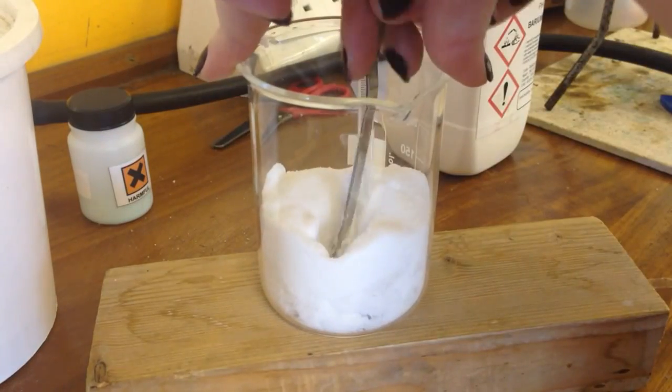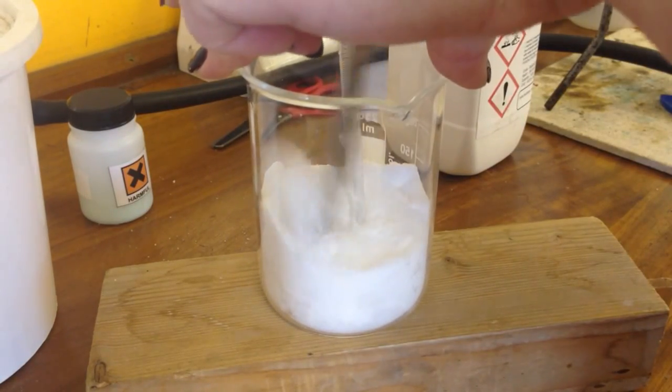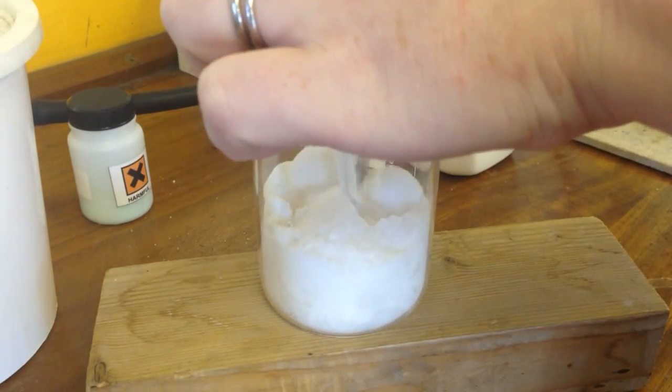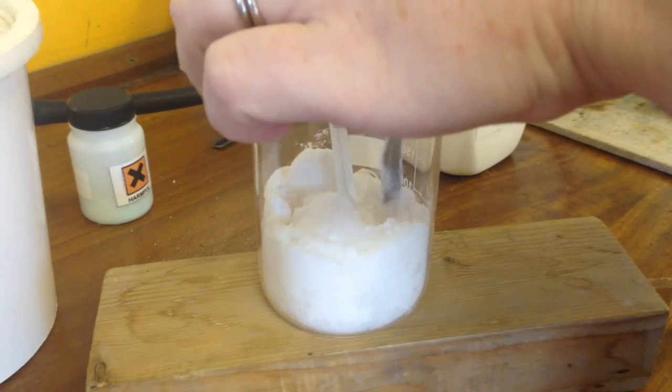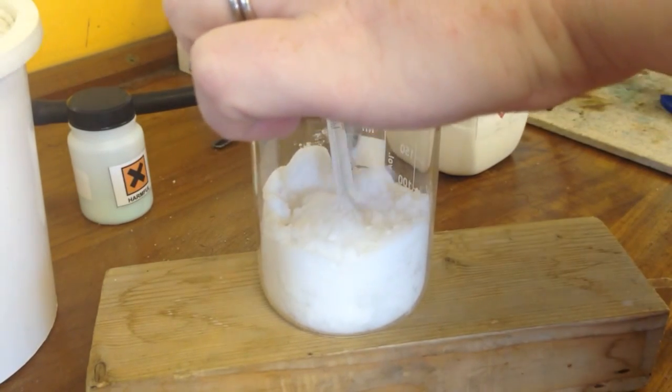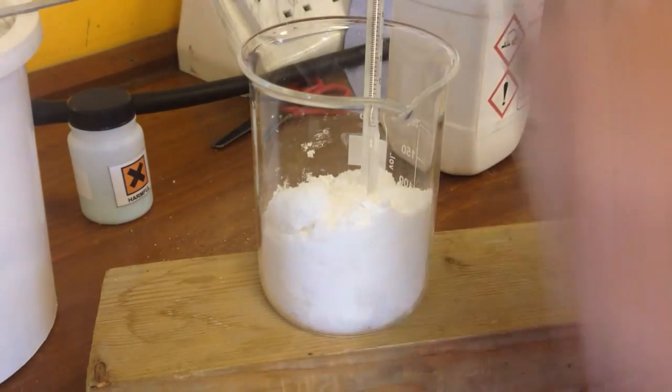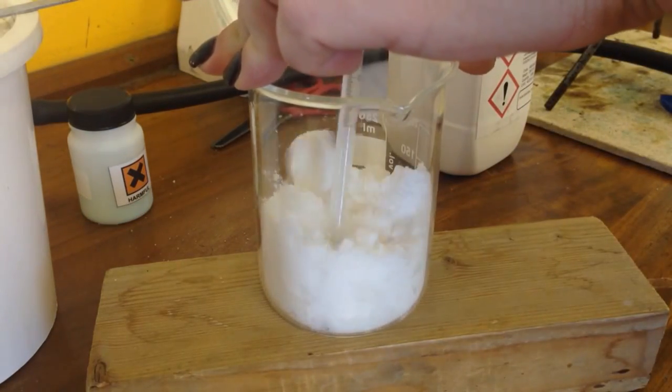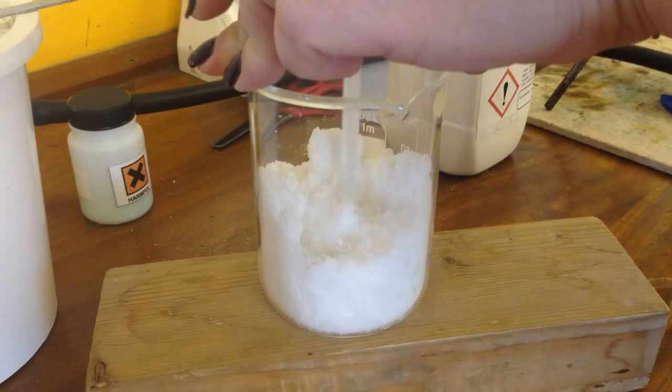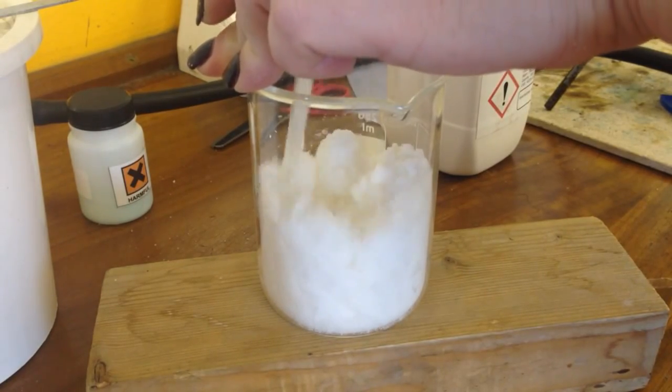So I'm just going to mix this up. It's quite hard to mix at first because I'm trying to mix two powders together. One of which is quite lumpy and the other one is quite fine. So they don't really want to mix up. Let me use my thermometer. It's really starting to smell quite strongly of ammonia now.